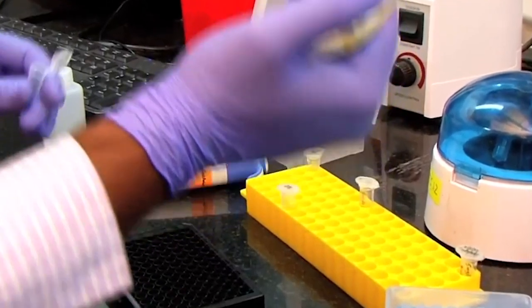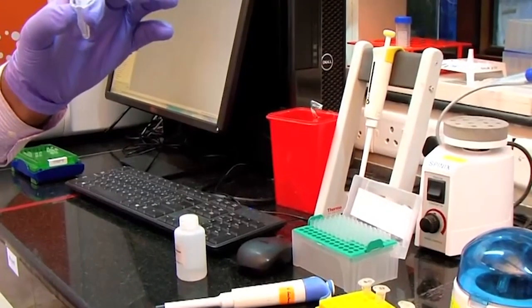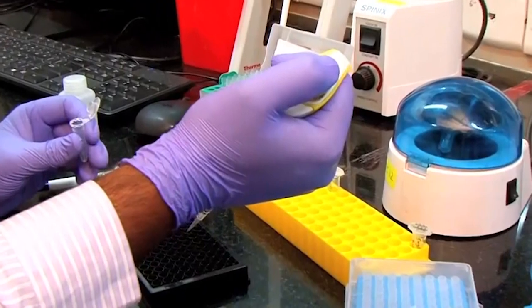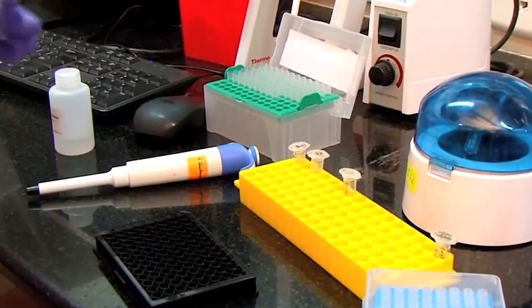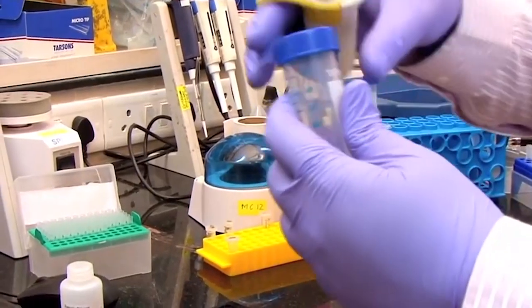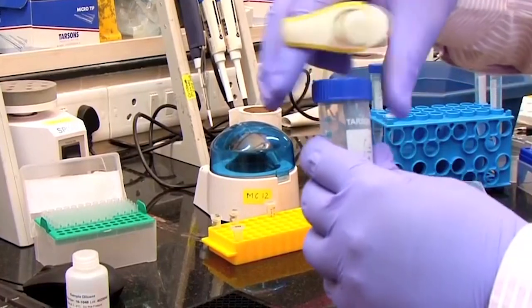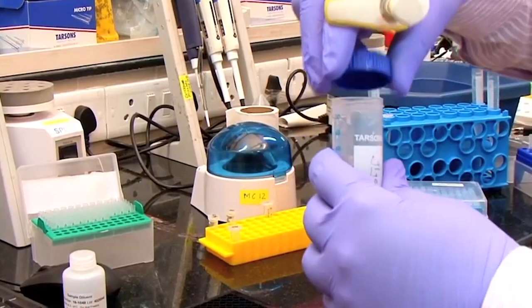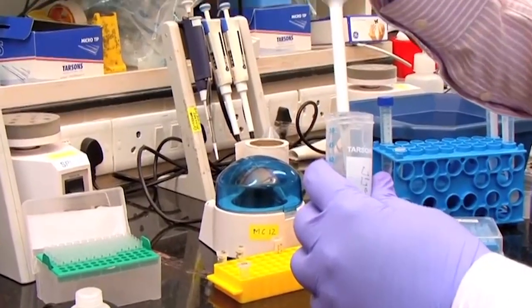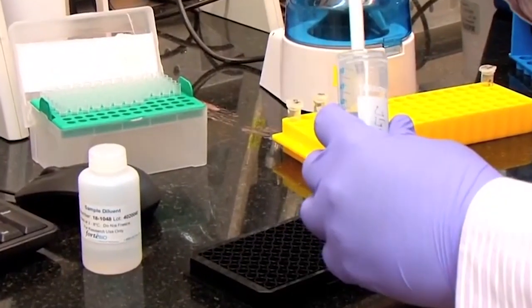This is sample number 2 at B4. The sample number 3 at B5. So there are 3 unknown samples. I'm using the glycine buffer, that is a pH 2, 10 millimolar glycine buffer. This is used for the regeneration of the sensor. The regeneration buffer I'm going to place at the A11 and the B11.